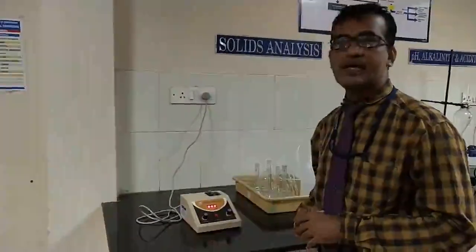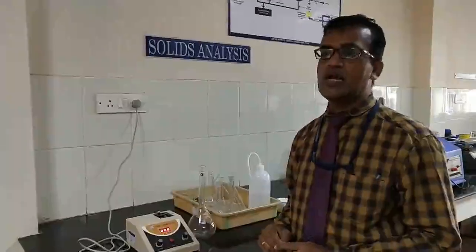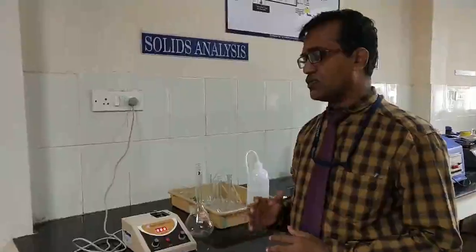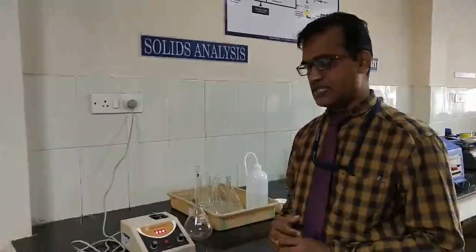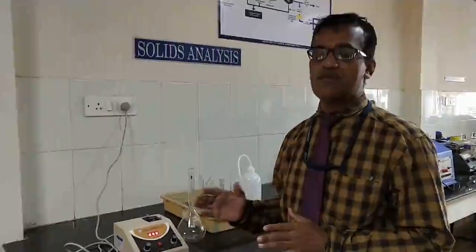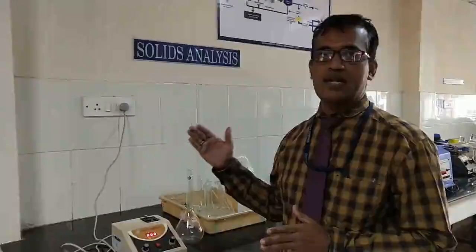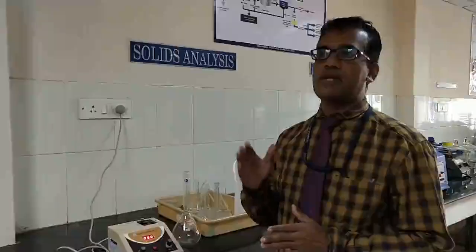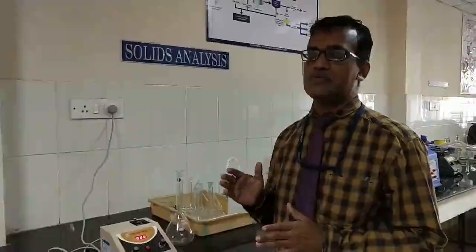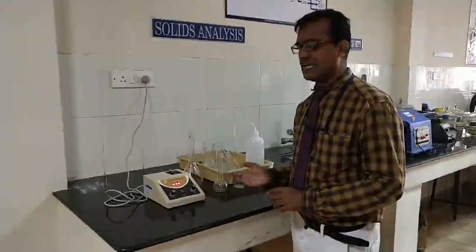So let us see how to conduct the experiment. Find out the concentration of unknown copper sulfate solution by using the digital colorimeter. To find out the unknown concentration, first we have to prepare solutions of known ppm concentration: 100, 200, 300, 400, 500 and then till 1000 ppm. By using those standard values, let us find how much copper sulfate is present in any sample.